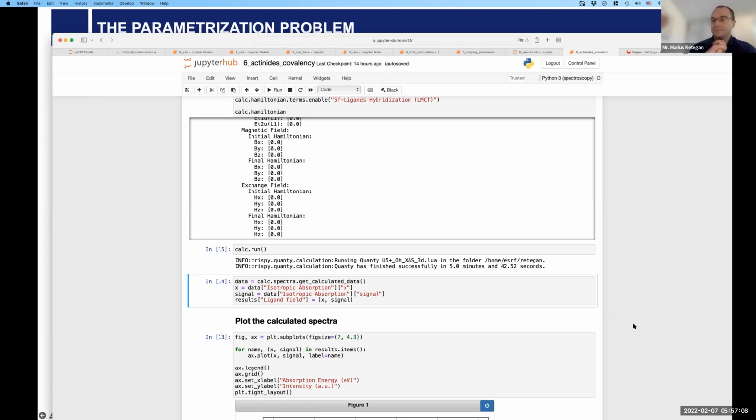So maybe Dimitri works a whole day on EXAFS analysis. But usually our students are not doing only EXAFS. So they do infrared, and they do another one, and they do some experiments, and they do some whatever. So maybe they work, I don't know, difficult to say, maybe 10%, 20% of their time. And then they would like to have a user interface.